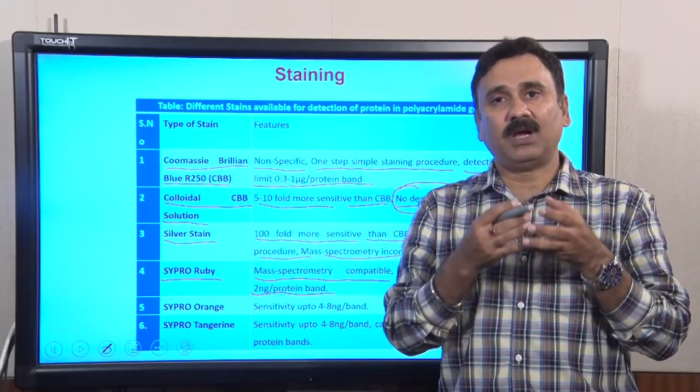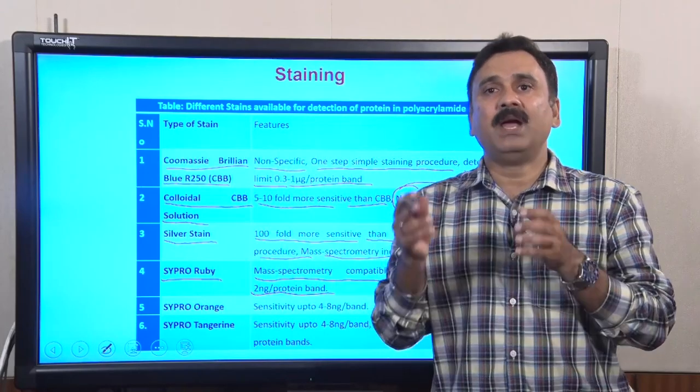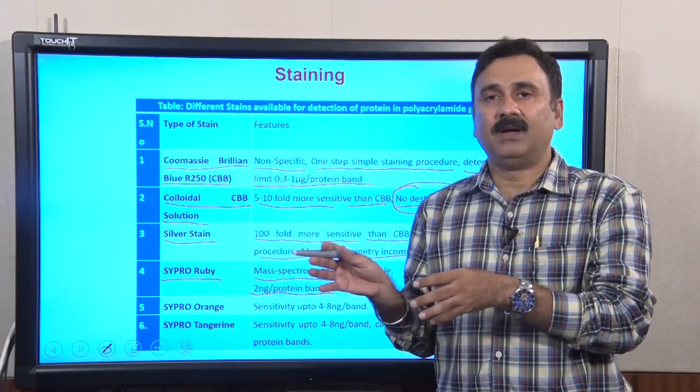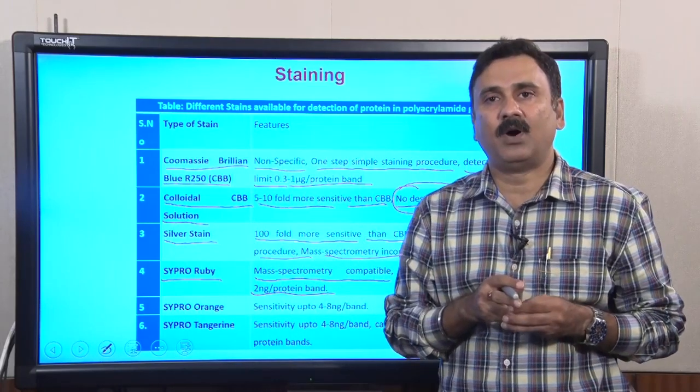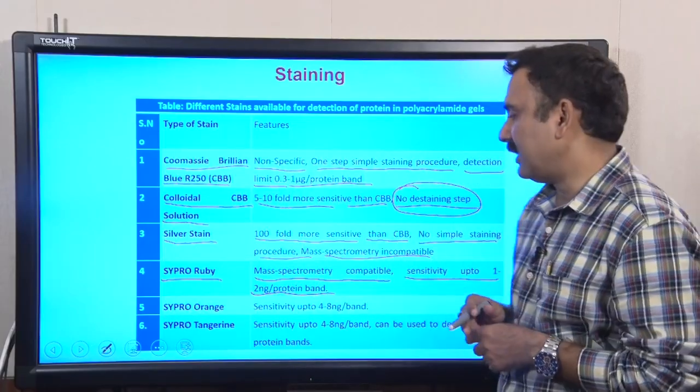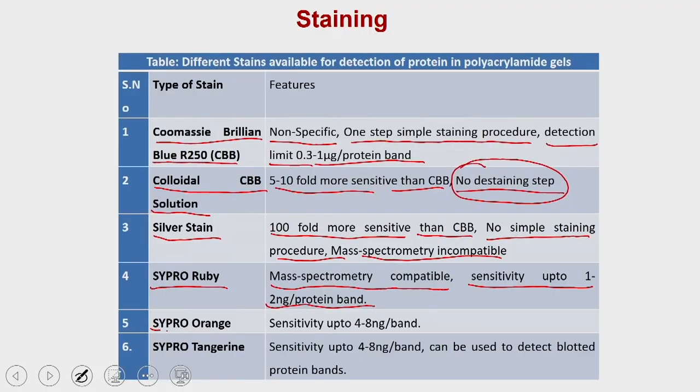Suppose you are resolving a complex biological sample and you would like to identify some of the proteins using MALDI or some other kind of downstream application, so you can use SYPRO Ruby. Then we have SYPRO Orange. It is sensitive up to 4 to 8 nanograms per band. And then you have SYPRO Tangerine. It is also sensitive up to 4 to 8 nanograms and can be used to detect blotted protein bands.